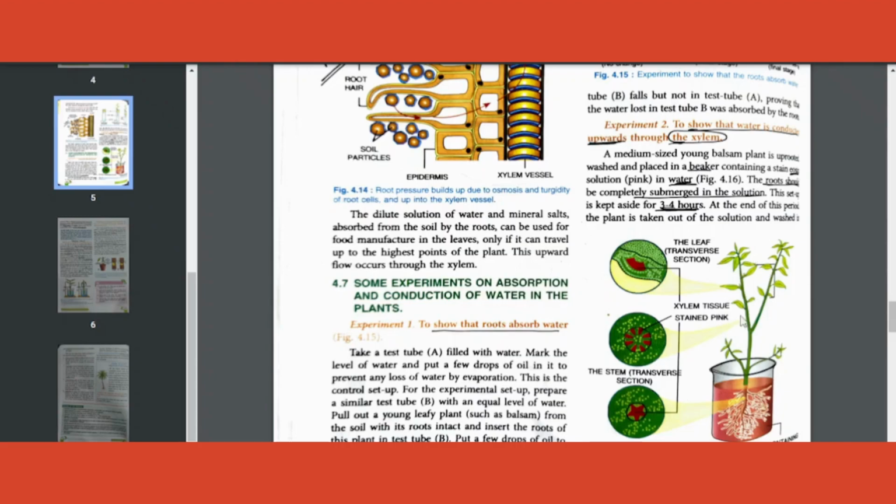But in the textbook, they have given eosin as the dye. EOSIN. It's slightly smudged here. Eosin is a pink colored dye. You add that to water and then keep the plant. So beaker, water, dye and then you add the plant. Leave it for some time.